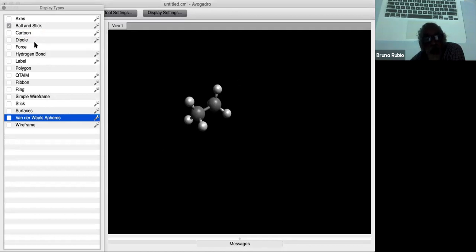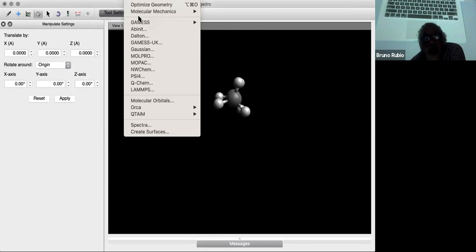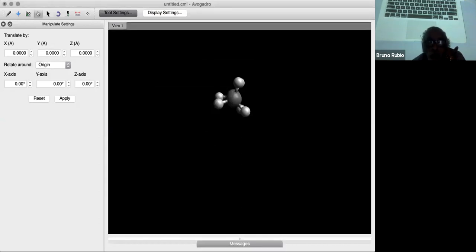All right, and so now let's calculate, with those hydrogens eclipsing each other, the energy. Extensions, molecular mechanics, calculate energy, minus 7.7, okay? All right, and so now what I'm going to do is de-eclipse them.